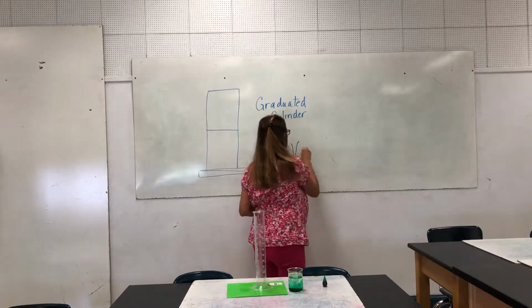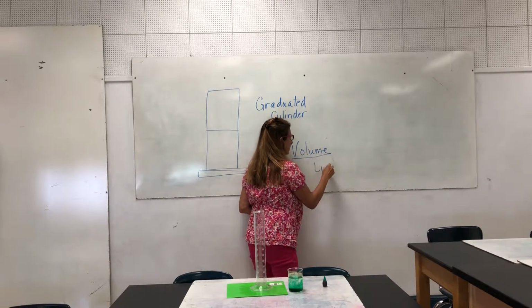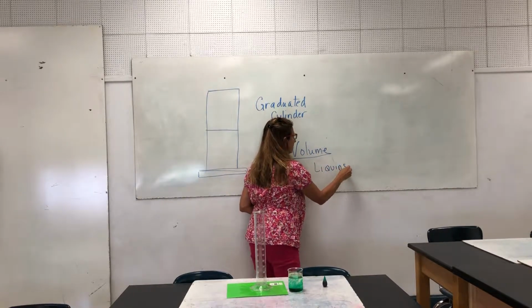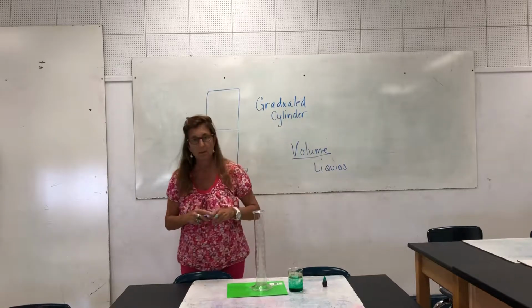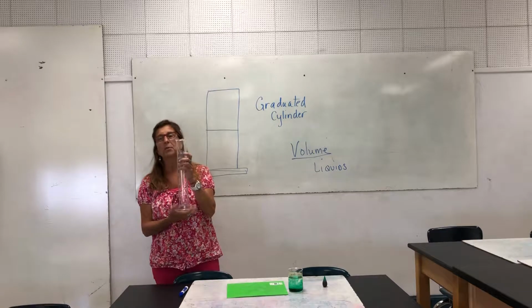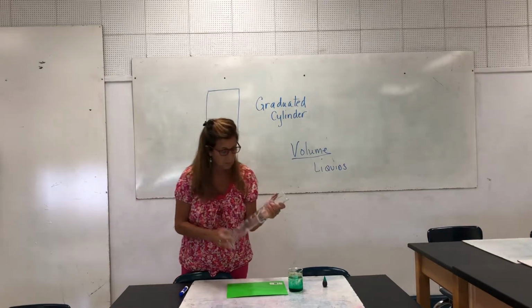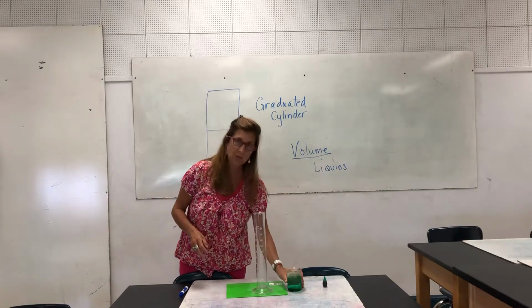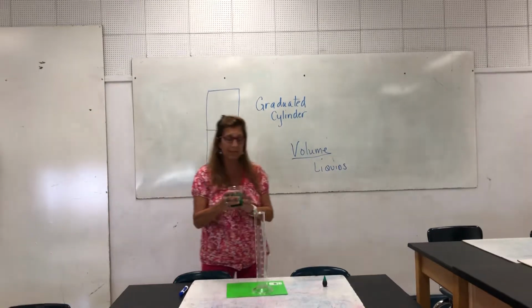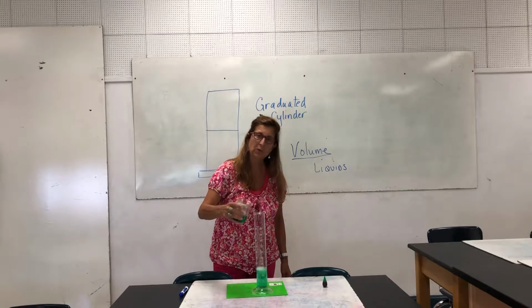What does a cylinder measure? It measures the volume of liquids. Volume of liquids or fluids. So this will measure up to 500 milliliters of fluid, and we're going to be working today to make sure that we can accurately read the amount of fluid that might be in a cylinder. And there's a little trick to this.